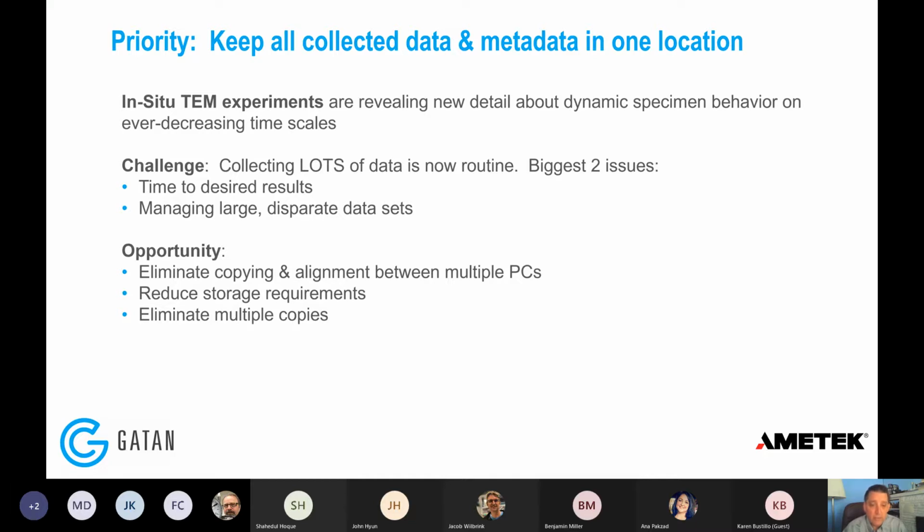Reduce storage requirements. It may sound like 50 terabytes is a lot of hard drive storage. And I forget who the talk was for M&M this year, it might have been Dave Mueller, said that they just purchased 50 terabytes of hard drives for a few $1,000s, several $1,000s maybe. But that is not a long-term solution. That's like short to medium term.